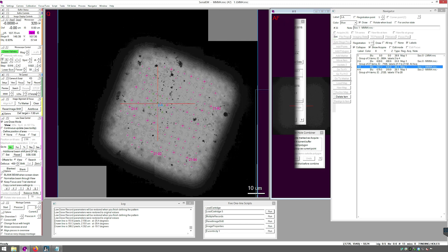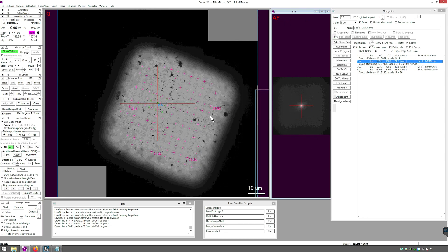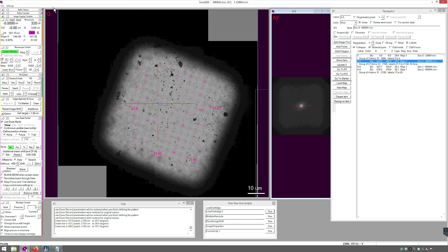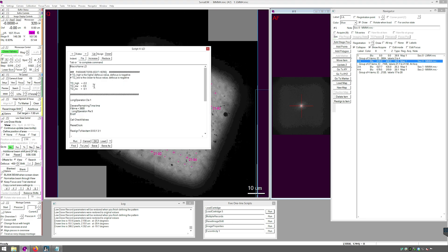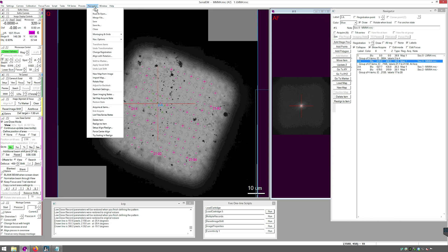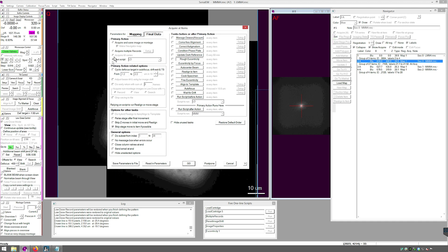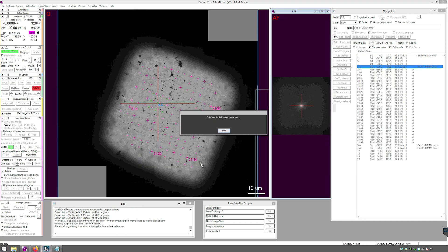Now I want to start my run. Check a few things, including Target to Focus. Press OK. Go to Navigator, Acquire Add Items, Final Data, Run Script LD. Skip Stage Move to Item if Possible is selected — that's OK because we have Realign to Item in our script. Press Go. DM will collect a dark reference and collection will begin.